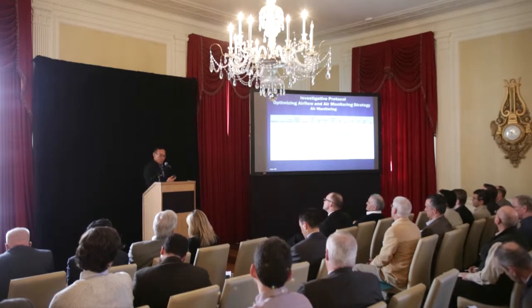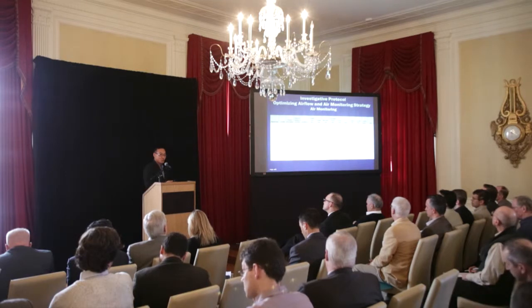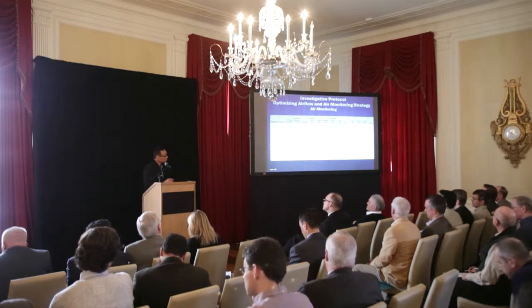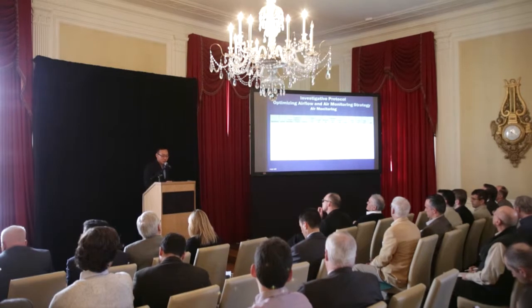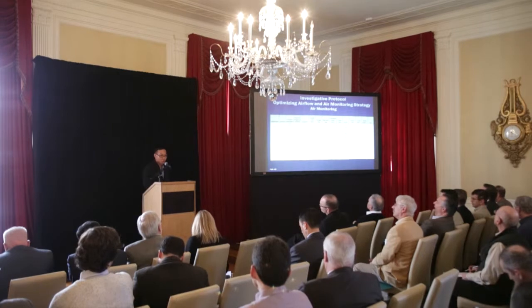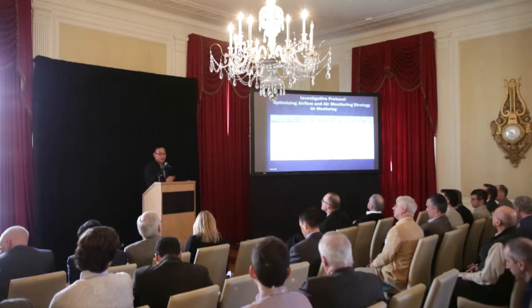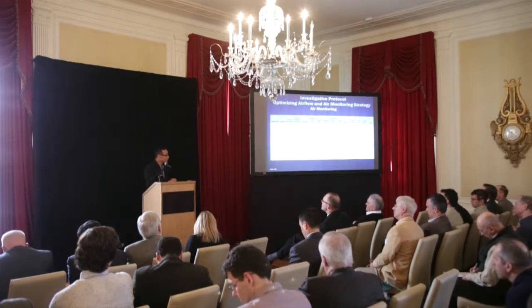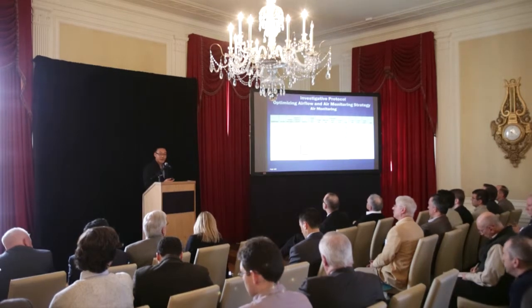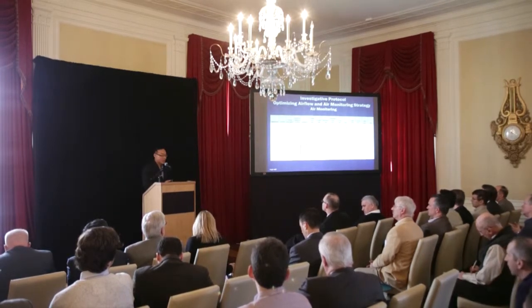We're keeping a big database of all of the areas, some of them 4 air change rooms, some of them 6 air change rooms. Since the Smart Labs program has been in existence since 2008, we haven't been getting any overexposures, which I would assume most people would say is the case in a lot of your labs, because obviously if you're having an overexposure to a certain chemical, that's a very bad thing, and putting a little bit more general exhaust dilution ventilation isn't going to solve your problem. You're going to have to do a lot more than that.